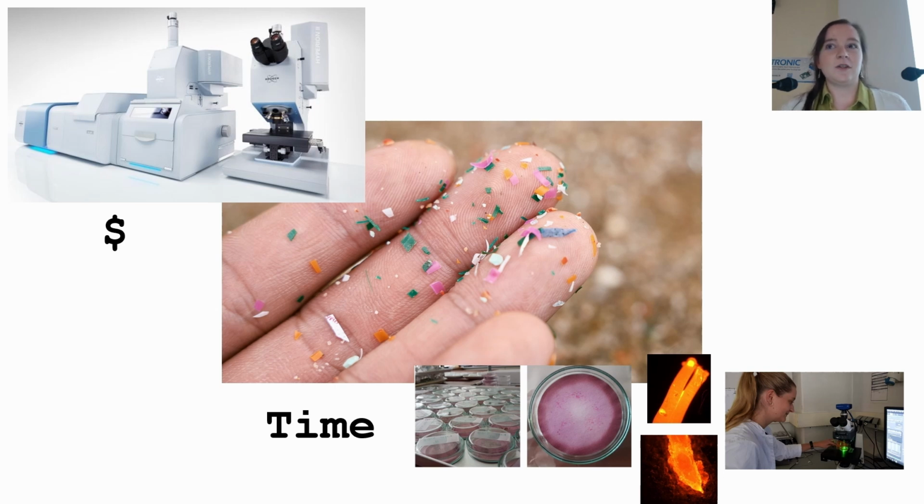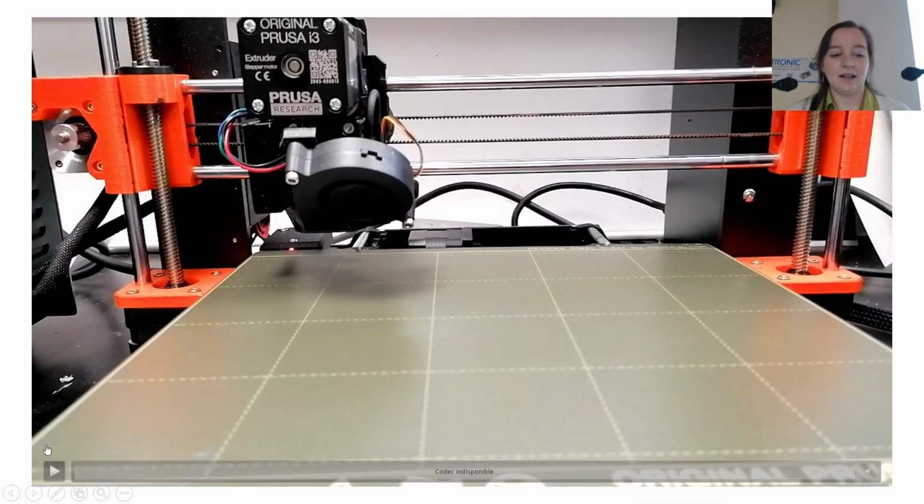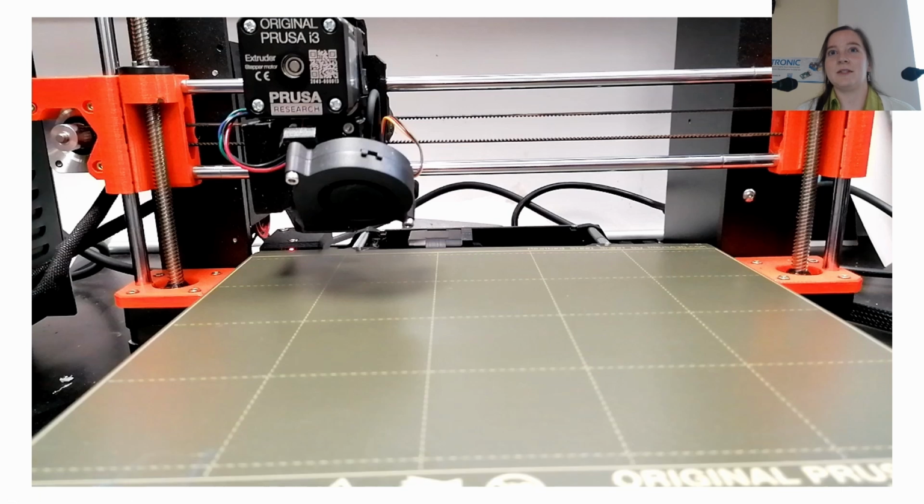So possibly we could go with this cheaper Nile red staining method, but automate it. So have an automated scanning fluorescence microscope that was cheap. So that's what we said we would do. We would build this microscope. And when we were thinking about how to build it, the main inspiration came from 3D printers. 3D printers have these fantastic scanning mechanisms that are very precise.